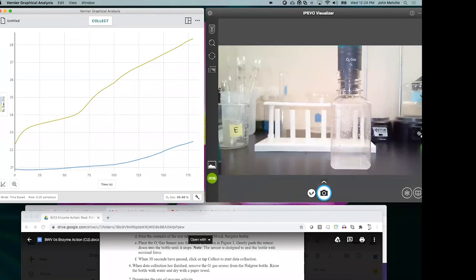We did have a question, John, on why there was an increase at 70 seconds? Exactly, that's what I'm going to get at. Thank you for that. It's related to the fact that, in both of these cases at 75 here, since the oxygen gas is being liberated, the data looks way better if you have it on a stir station. Why don't I just do one more run? I'll do 10 drops, but I'll put it on a stir station. We'll do everything exactly the same, and you can compare the rate to see how that looks. So let's do that really quick.